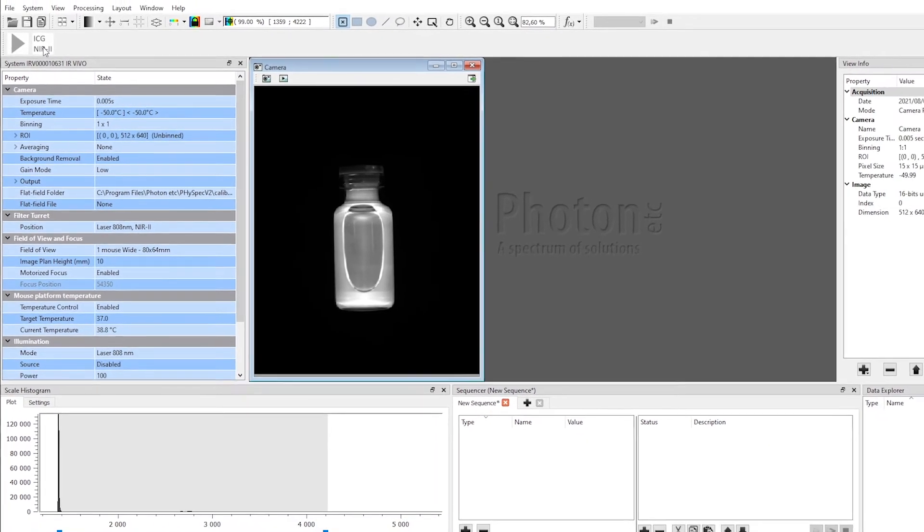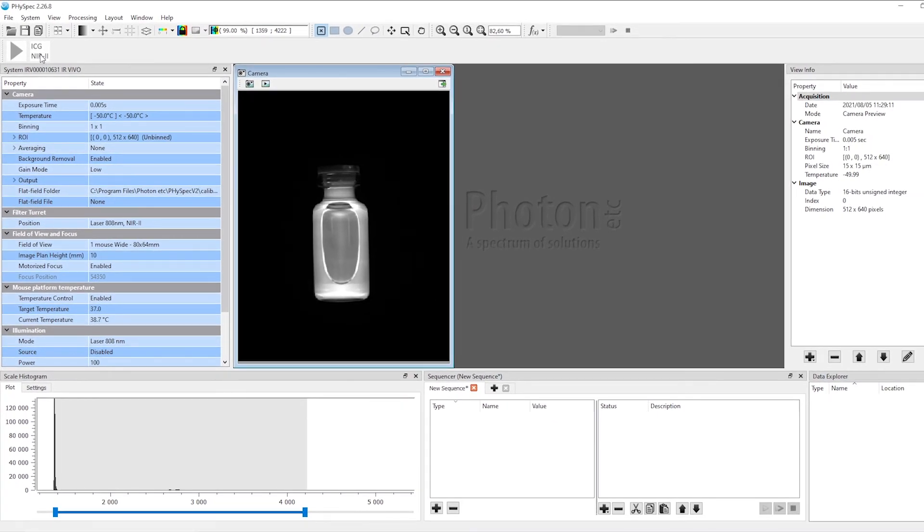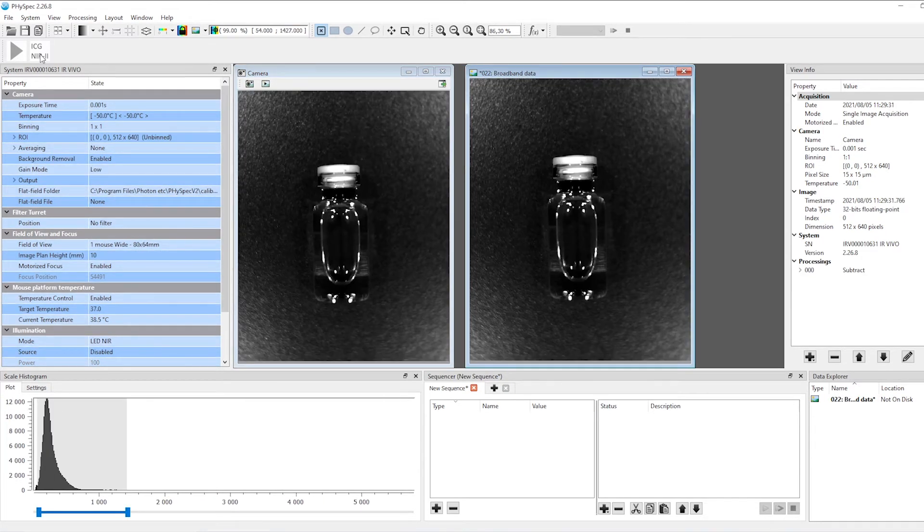This sequence is pre-programmed to simply capture broadband and fluorescent images according to the settings we first chose. Many sequences can be made to accomplish various operations from simple image acquisitions to temporal analysis.